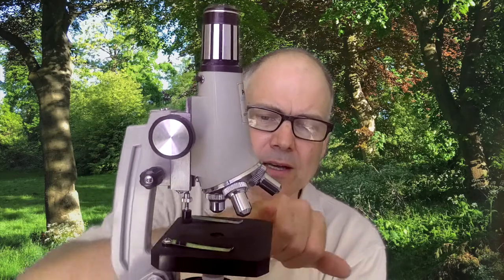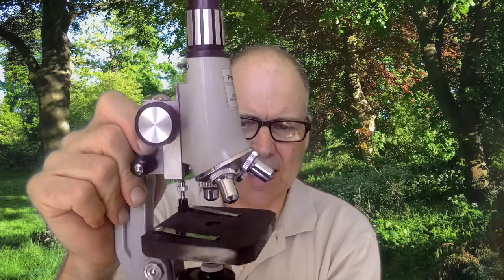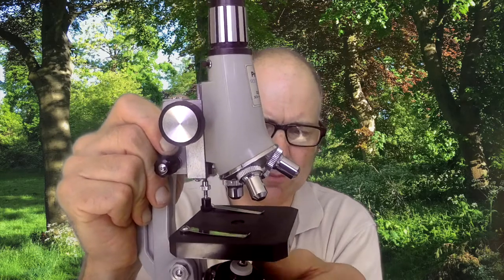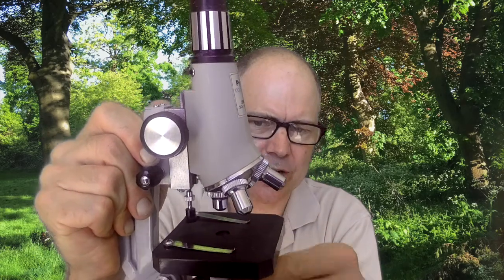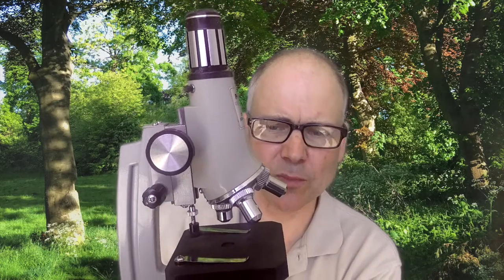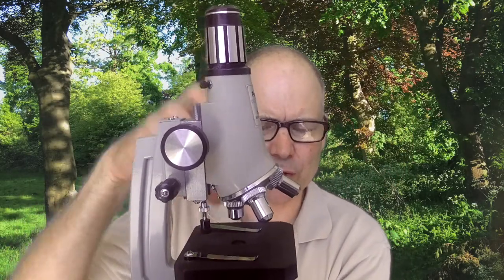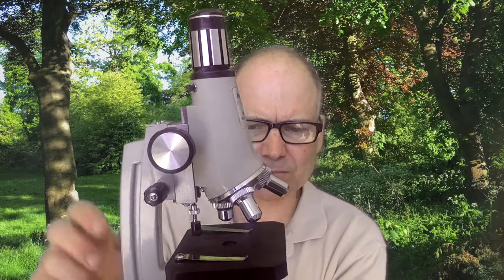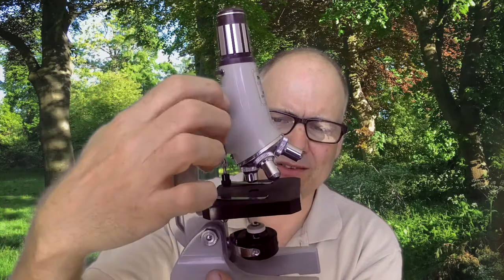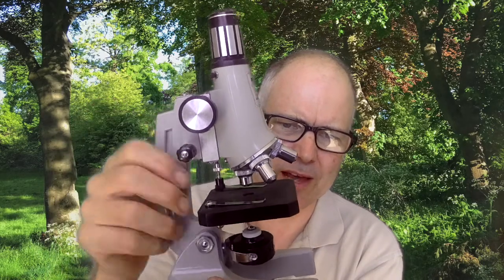The sample is mounted on the stage, so you have these clips, and this is where you would put the slide that has the sample, and then you can illuminate the sample from below. There's a light here, a little bulb, which would turn on, and that shines the light through the bottom of the stage, and it's particularly useful, of course, for transparent or semi-transparent specimens. Otherwise, you need to rely on the light coming in from the sides in order to illuminate from the top to allow you to look at opaque specimens. And you use the coarse focus here to bring the objective lens down and focus on the sample, and then you can further tweak that with the fine focus there.